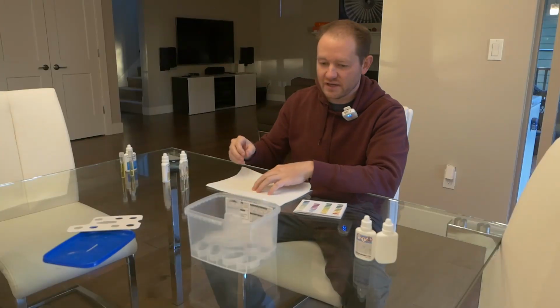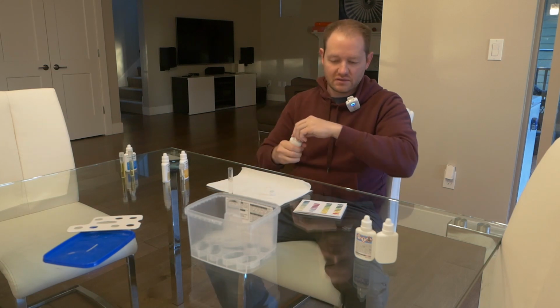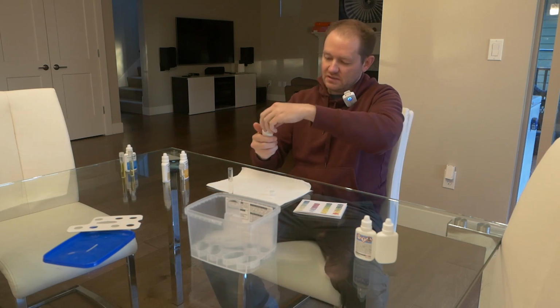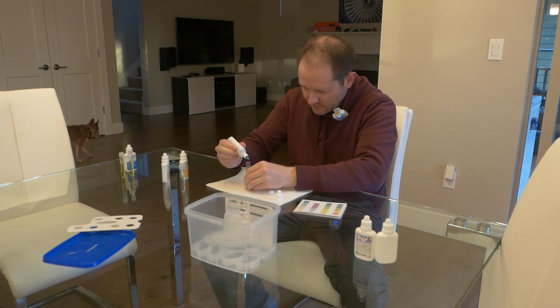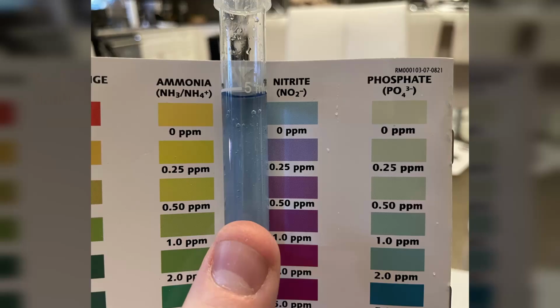Next we'll test our nitrite. We've got simply 5 drops here. And looking maybe a little bit darker than 0, but barely.